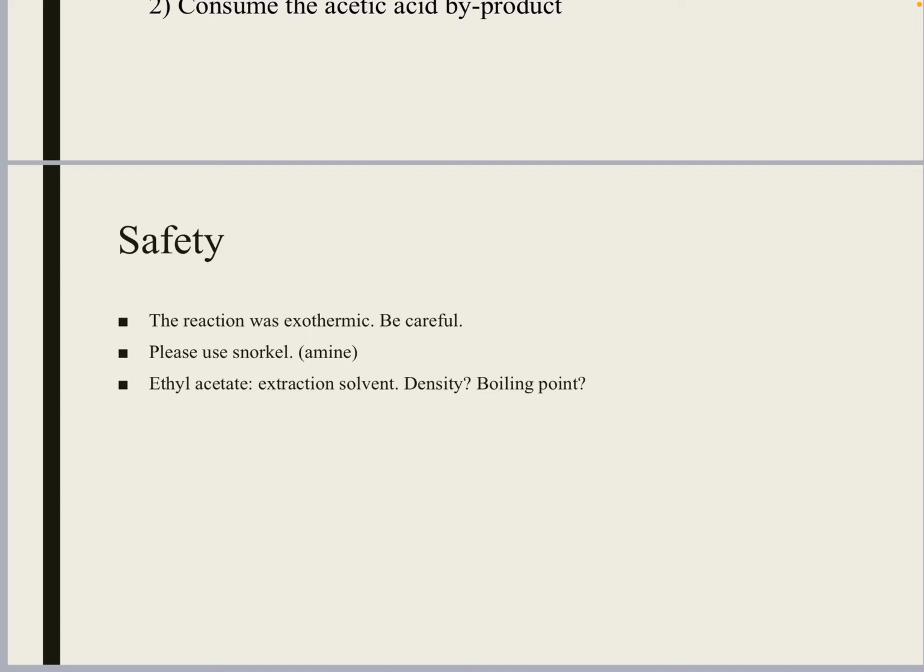Which means that when you're extracting your solid product into ethyl acetate, it's going to be a liquid-solid extraction. The compound that's going to be left onto the filter paper on the funnel will be unreacted catalyst aluminum oxide, which means that there won't be any aqueous layer, right? So you don't have to worry about the density of ethyl acetate. And always follow your product, which is a solid being extracted and dissolved into ethyl acetate. So follow the liquid filtrate.